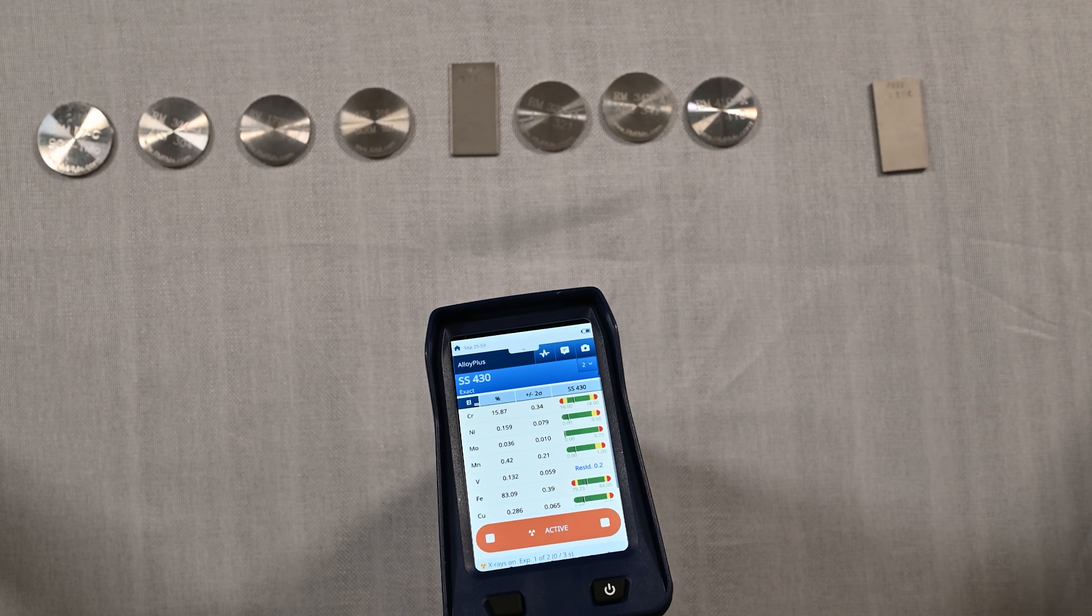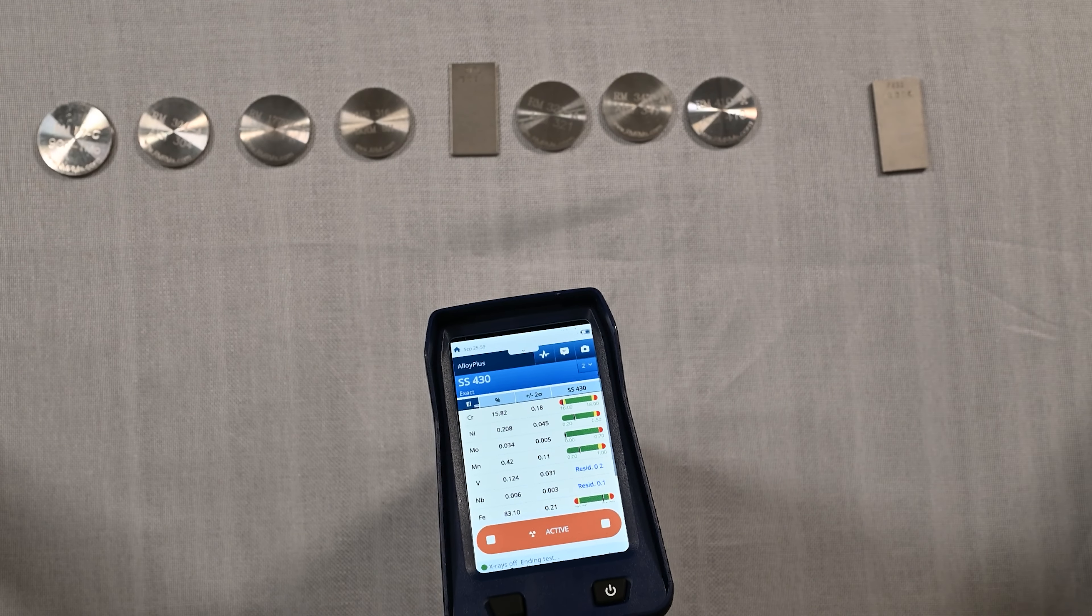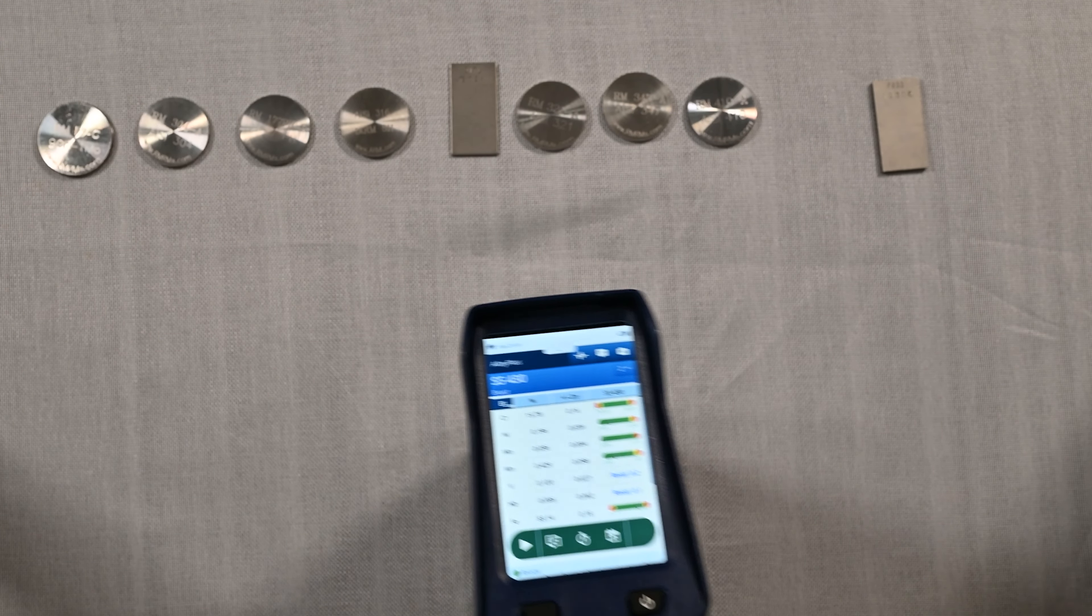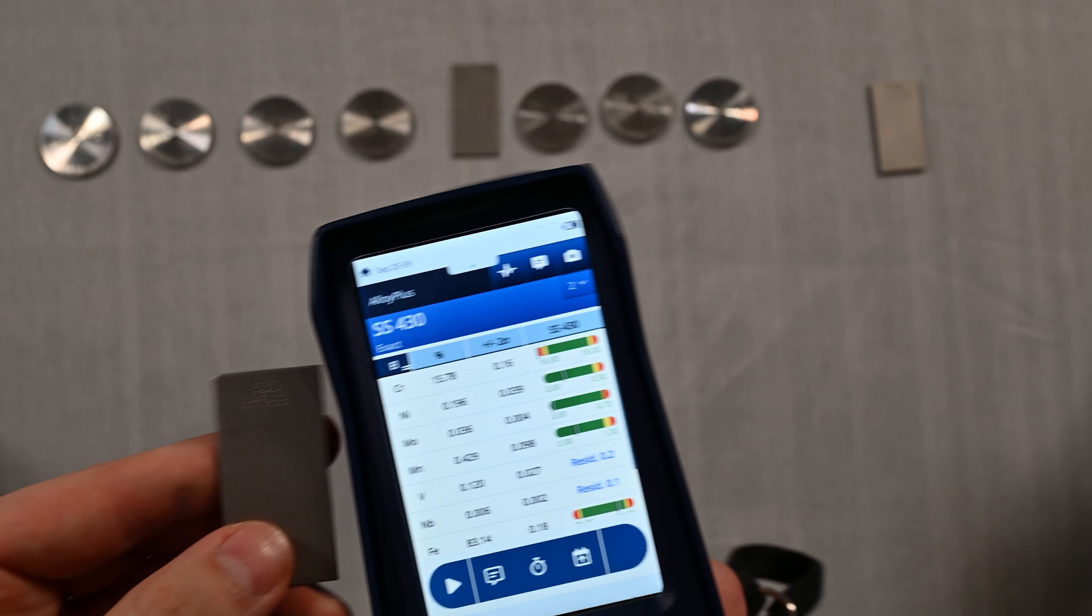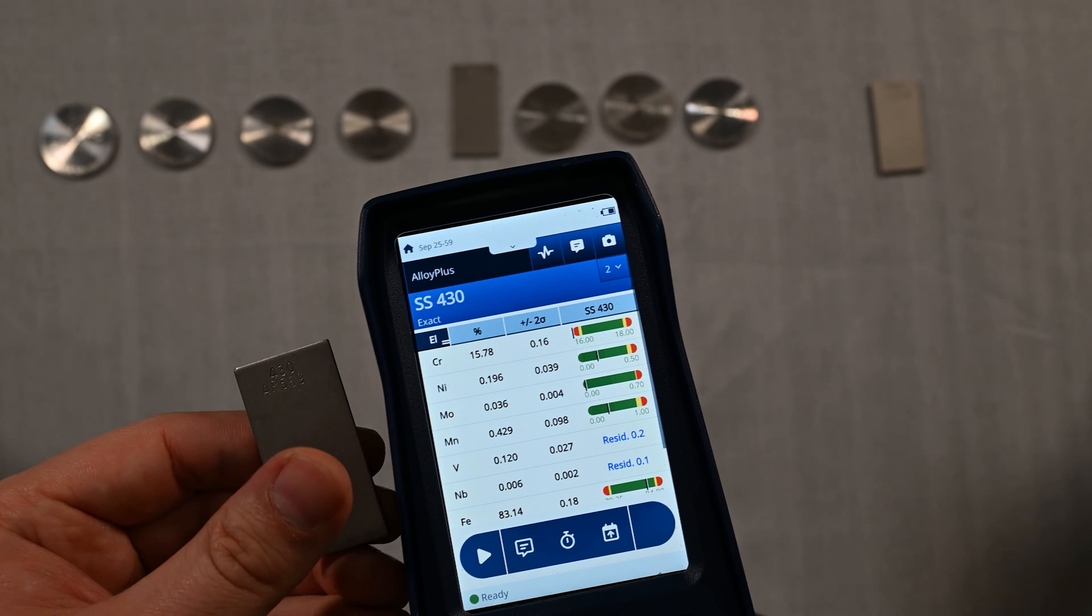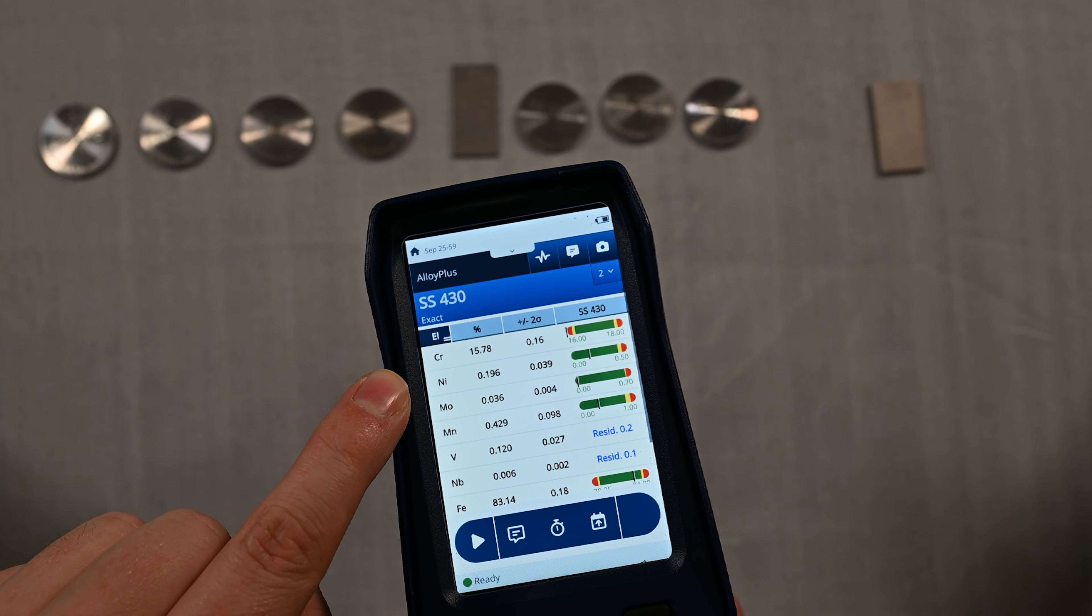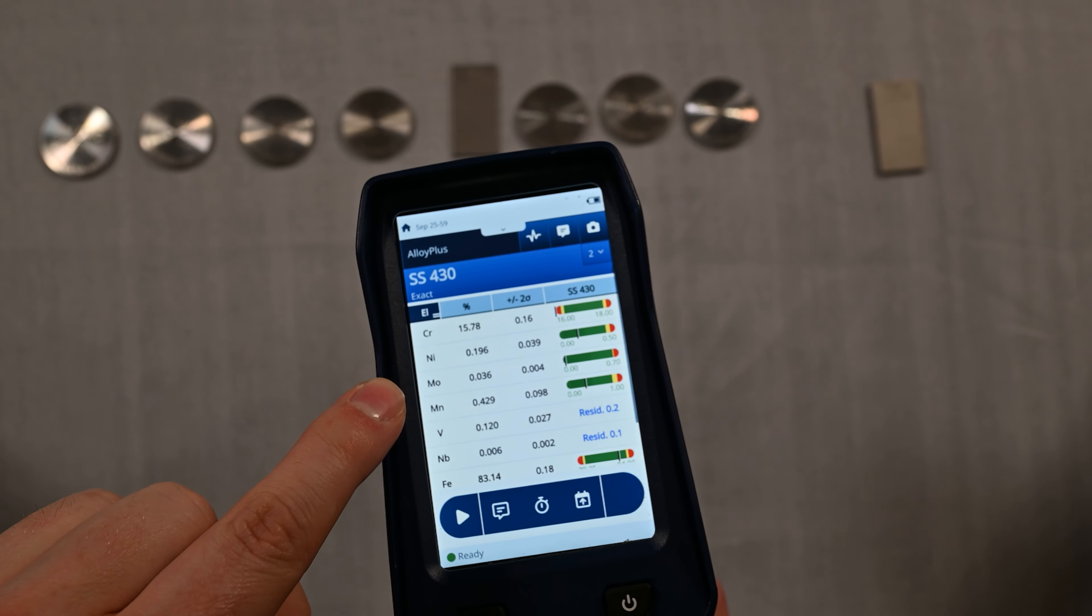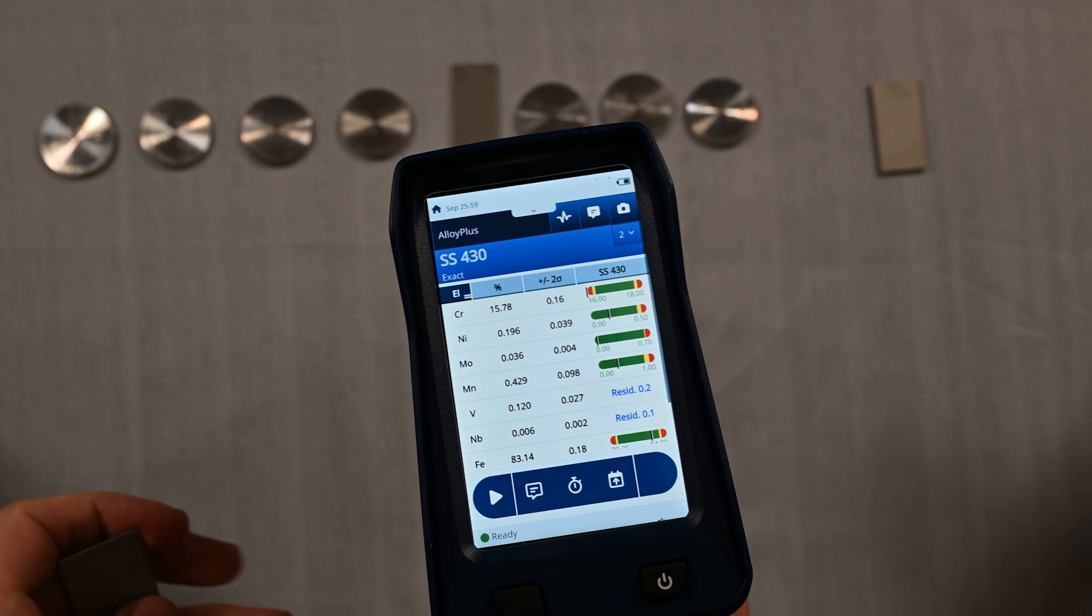Now we've got a 430 alloy. You'll see real quickly we're able to identify 430 with no problem. But just like that 410, those 400 series alloys lack that nickel content a little bit, only about 0.2% nickel, but still able to grade identify really easily.